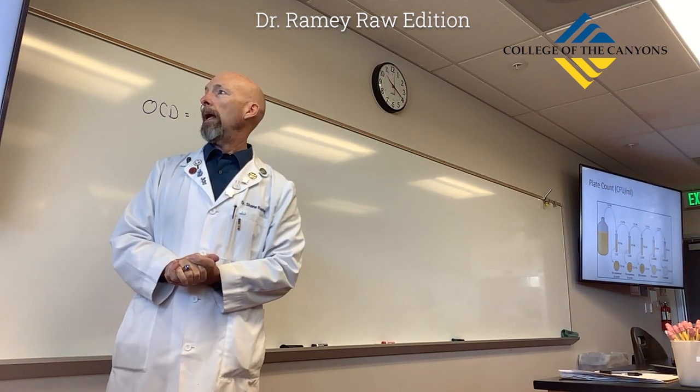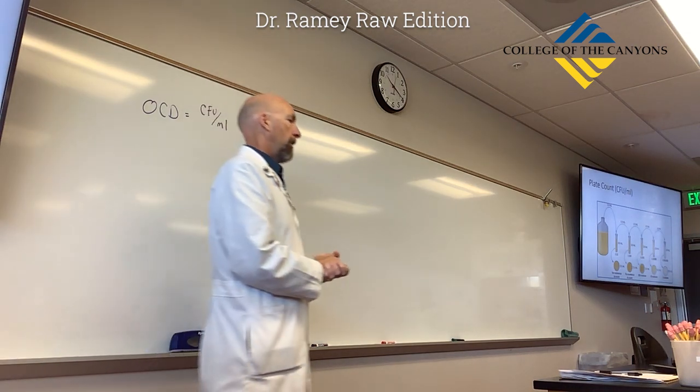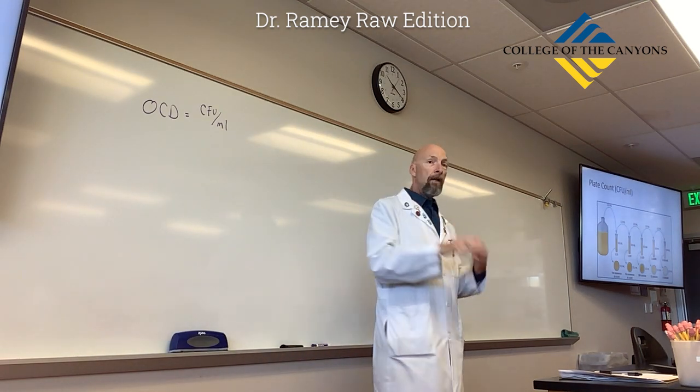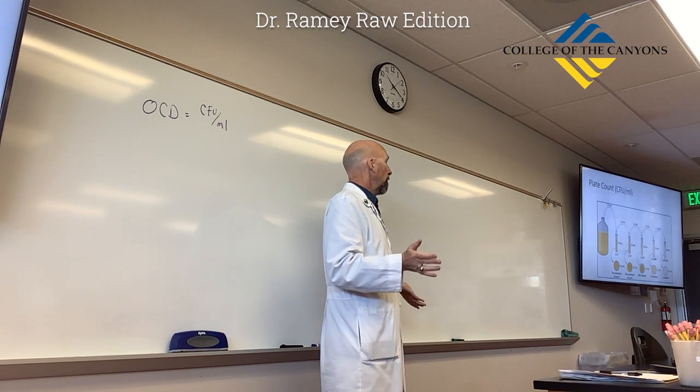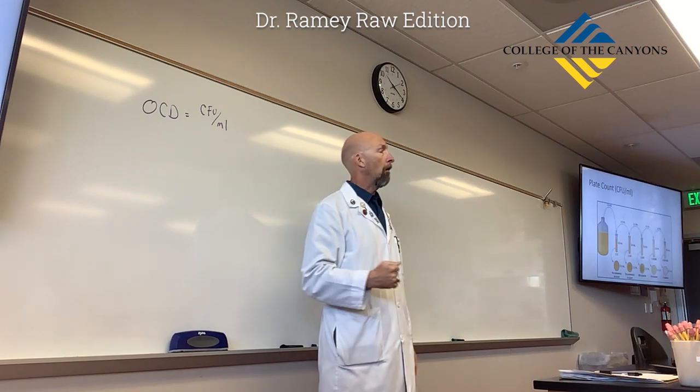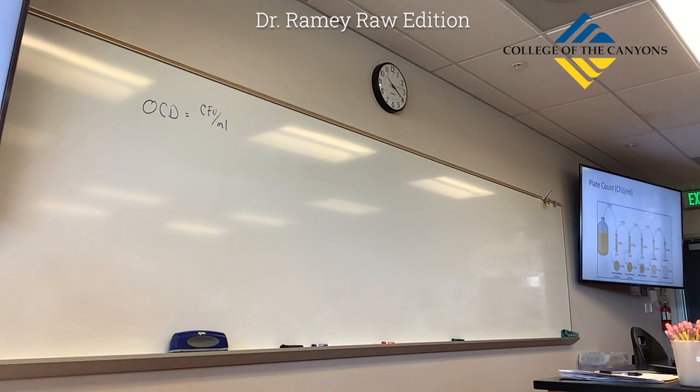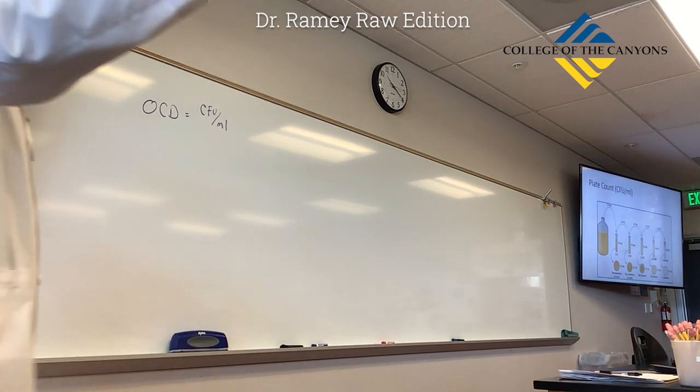Now, in the diagram here, oh, well, by the way, before I get to the diagram, this could be very, very simple, right? Colony forming units per mil. No problem. Let's take a nutrient agar plate, one of these TSA plates right here.